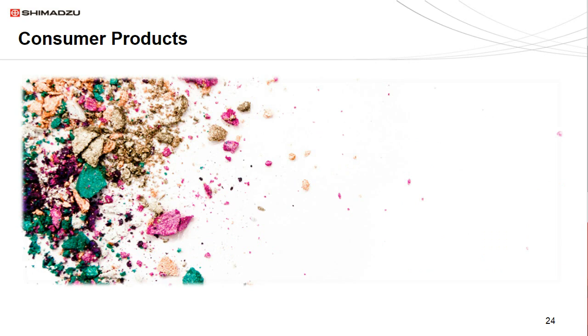Py-GCMS of polymeric materials in all forms can routinely be performed with little to no sample pretreatment whatsoever, and this often provides unique information about the composition of the sample. This key fact is what makes it such an extremely useful tool for polymer characterization. And what we've seen so far is that there is no limit to polymer characterization. In this case, when we begin to talk about consumer products, we will go down the lines of mural paint, and even makeup.